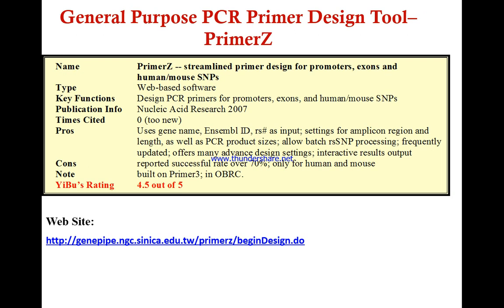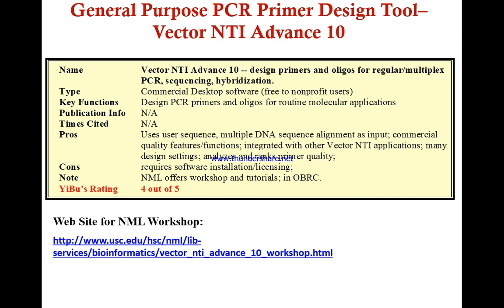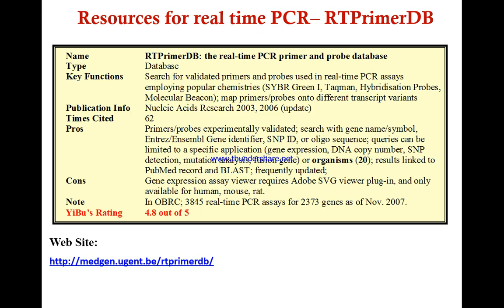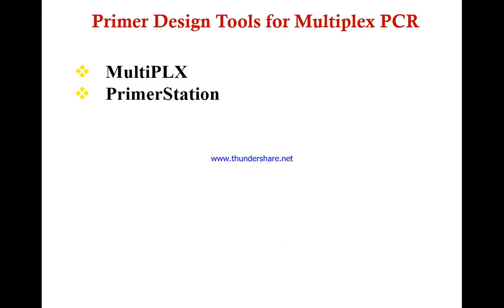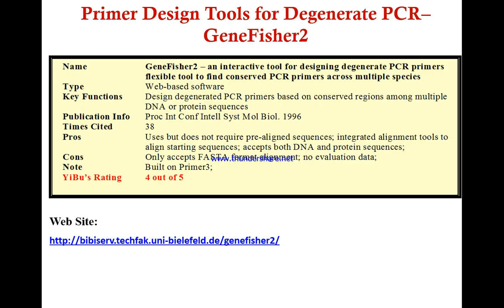Primer design resources for real-time PCRs are these 6. You can pause it and read about these online primer designing tools.